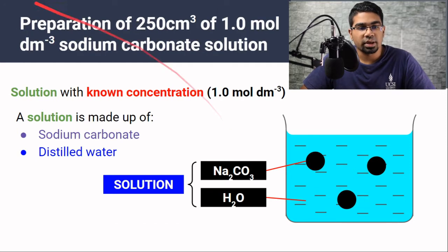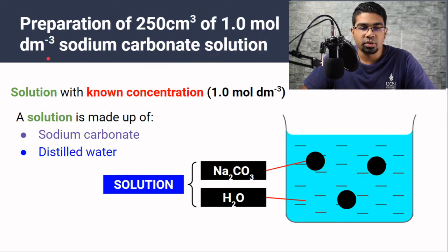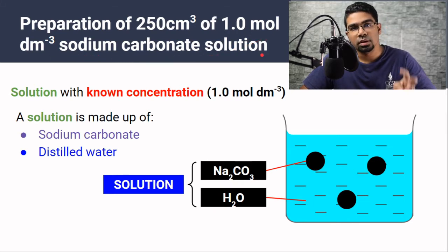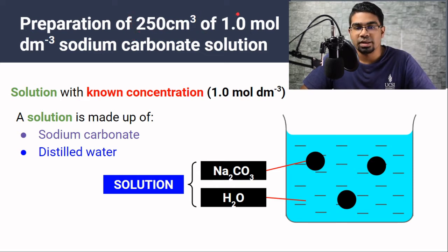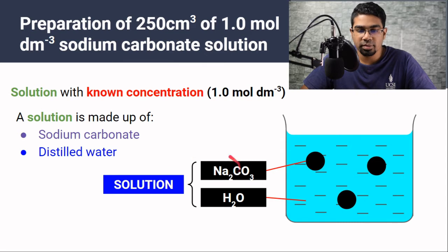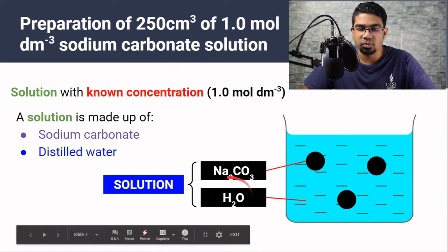In this video, we're going to be looking at the preparation of 250 cm³ of 1 mole per dm³ sodium carbonate solution. There are two things to note: we know the exact volume of solution we are going to prepare and the exact concentration we want to achieve. A solution of sodium carbonate will have sodium carbonate as the solute dissolved in water.